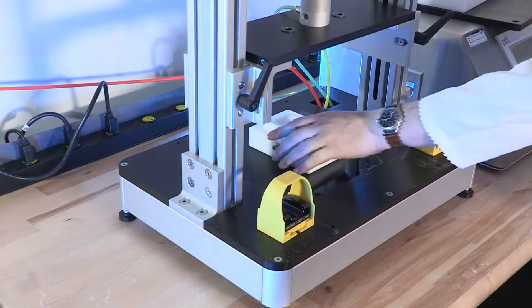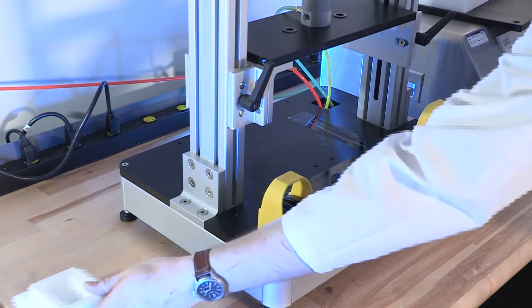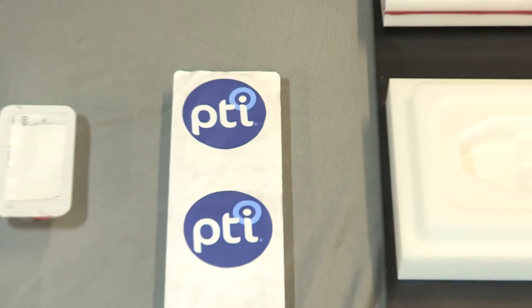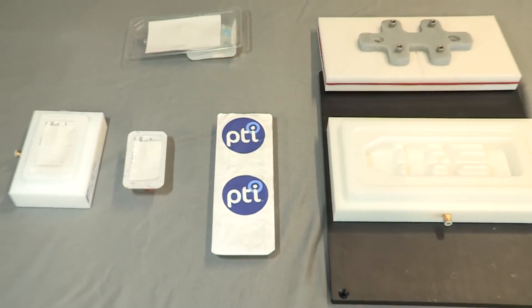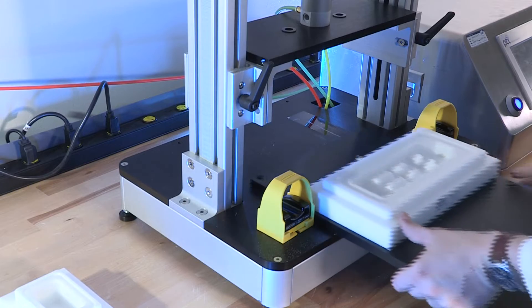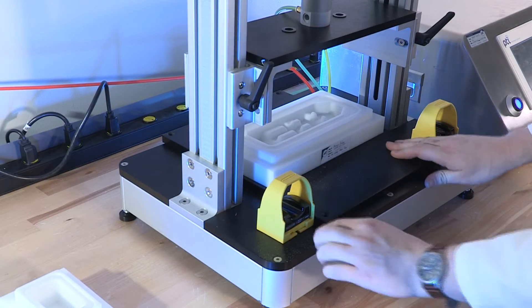We can accommodate most formats of Tyvek tray with different sized custom vacuum chambers and they can all be used on our same standard sized pneumatic test bridge with easy changeover.